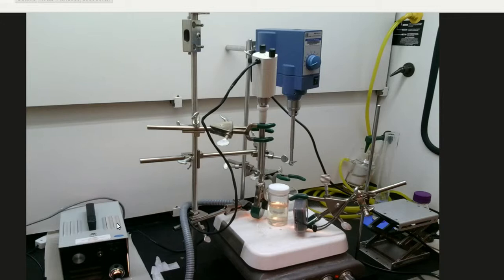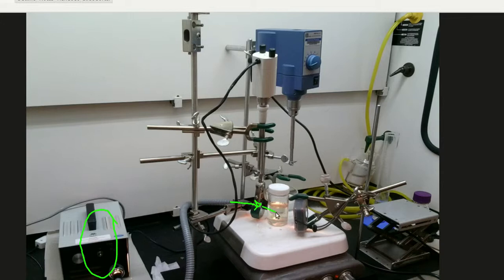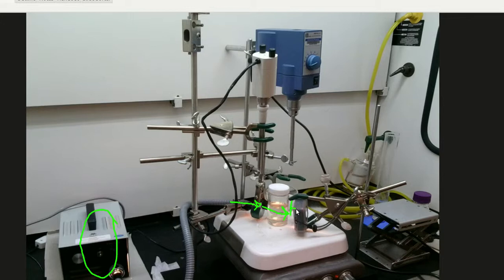Briefly, the setup consists of a light source which traverses through a polarizer. Once it goes through the polarizer, it traverses through the sample which interacts with all the sample including the air bubbles and API. Typically, there is a second polarizer not shown here and then finally the images are recorded on a camera.